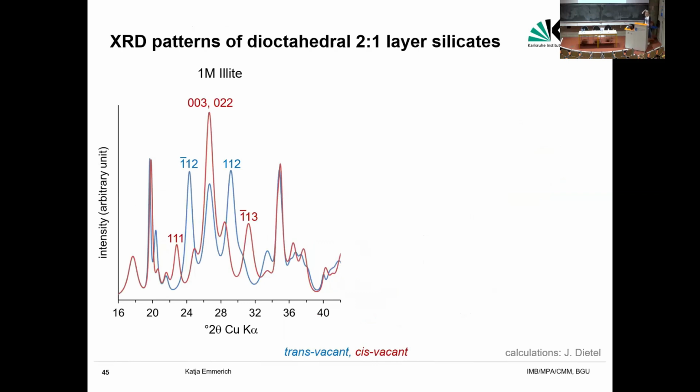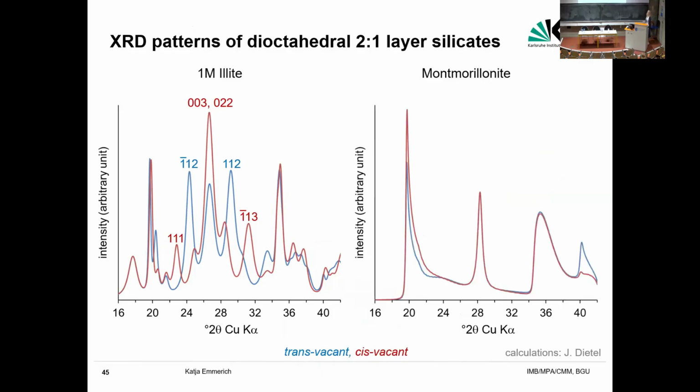In the case of illites or micas, you can get the information on the octahedral structure from hkl reflections of the X-ray diffraction pattern, if you have not a textured sample, but a nicely untextured, unoriented sample. Smectites, unfortunately, are turbostratically disordered, so from X-ray diffraction analysis, hkl reflections would not tell you anything about the structure of the octahedral sheet.